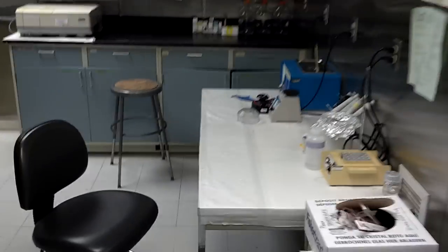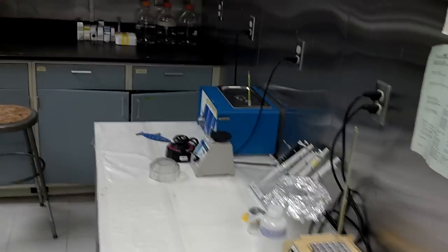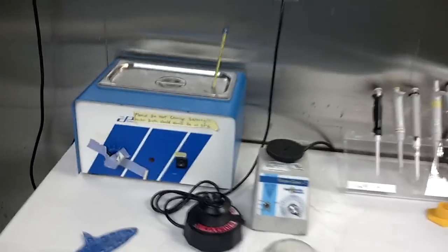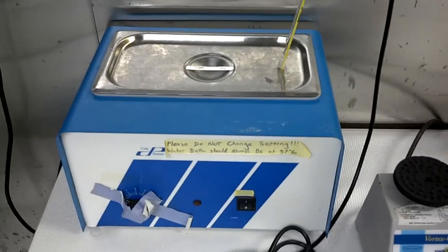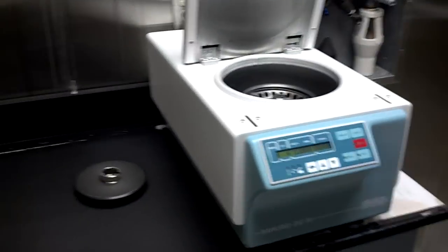This is the clean room. This is where we do some work, cellular work. Here's where we do the denaturing of proteins for PCR. This is one of our little centrifuges. All kinds of scientific equipment.